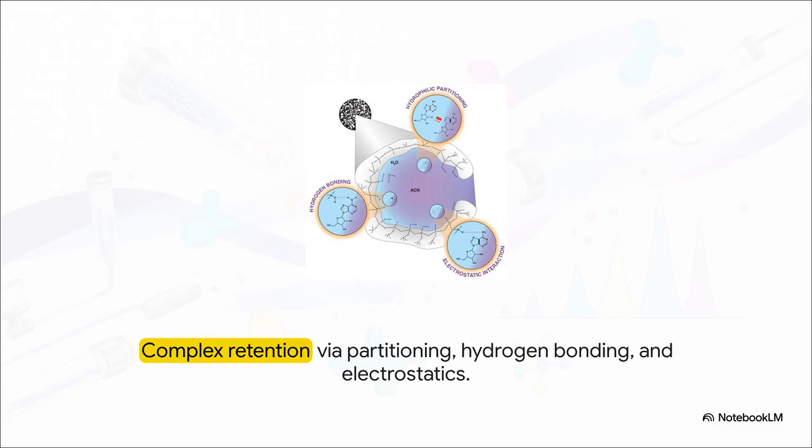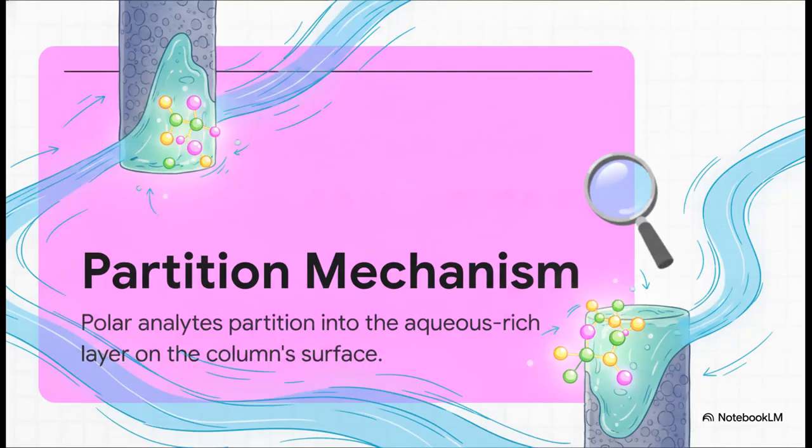Once that layer is established, your analytes undergo hydrophilic partitioning. But that's not all. They're also experiencing hydrogen bonding, dipole-dipole interactions, and weak electrostatic interactions with the stationary phase itself. It's this whole symphony of chemical forces working together to grab hold of those highly polar compounds. To put an official name to it, the primary driving force here is the partition mechanism.